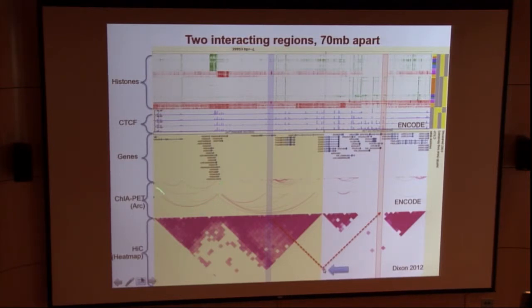So this is how we encode it. We have different ways of looking at interaction data. This is the arc view; ChIA-PET data usually comes this way. Each arc connects two interaction partners, and this is the Hi-C data. Some of you have probably seen this data before. Each little cell represents the likelihood of two regions interacting with each other. So technically it's sophisticated, but the concept is really simple, right?